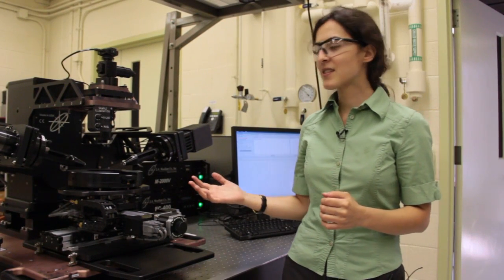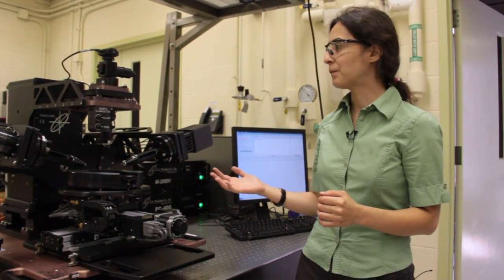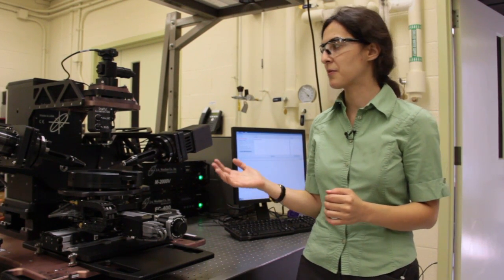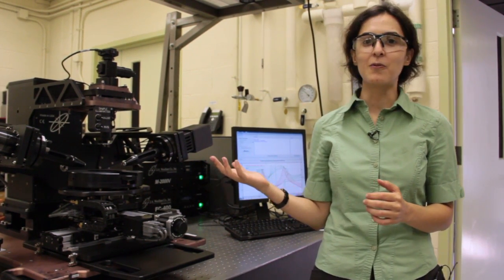This is our ellipsometer, the M2000 ellipsometer from Woollam Company, which we call WALL-E for short.